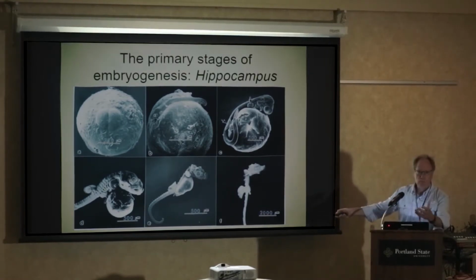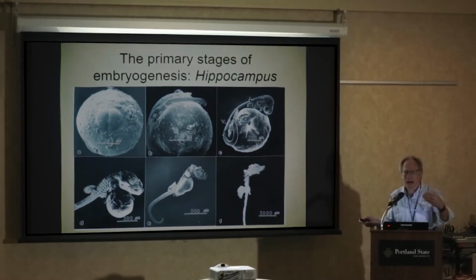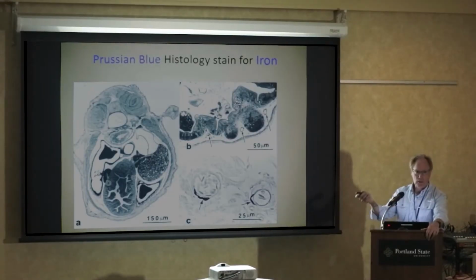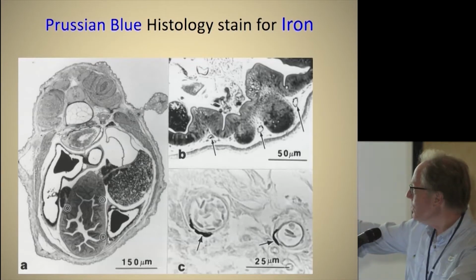These have pinkish cells, and they begin the synthesis of hemoglobin, which, as you know, needs iron. So we're going to follow this for where does the iron come from for the hemoglobin, where does the calcium come from to make the skeleton. And this gets into more light microscopy, eventually EM. There's a cross-section of one of those embryos, again, neural tube, notochord.